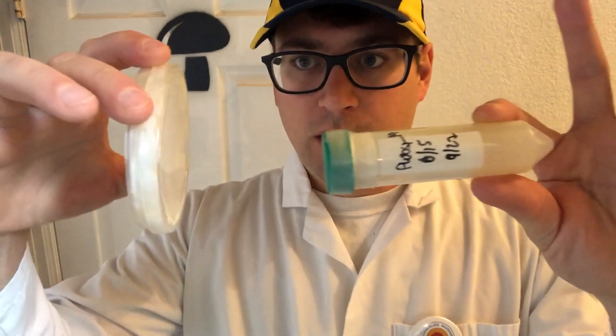The number one reason to use slants is that they're more secure. They're a little more difficult to work with, but they're also more sterile — there's less risk of contaminating them when working in a hood. Notice the opening of a slant compared to a plate: there's much less surface area for contaminants to enter.